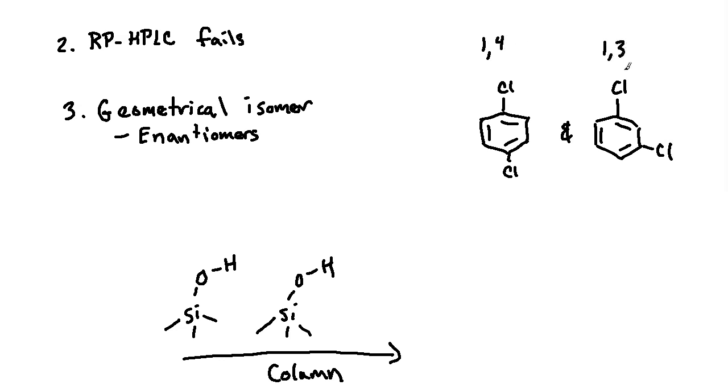For those of you that may be a little far away from organic chemistry at the moment and haven't heard that in a while. Okay, but they are, right, the same number of hydrogens, carbons, chlorines present. They're just arranged in a different fashion. So you could see where this might become problematic when you say, oh, I'll just throw these into this type of extraction, or I'll separate them out by boiling or things like that.